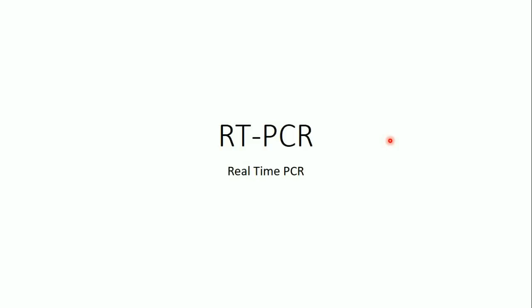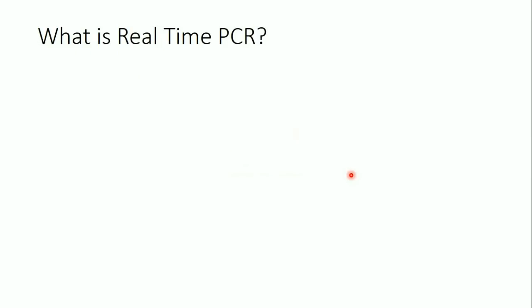Now in this video I'm going to speak about real-time PCR, the principle, the technique, how does it go, and everything related. I also will speak about reverse transcription because it's used widely in real-time PCR, and also the data of real-time PCR. So let's, as usual, start by asking what is real-time PCR.